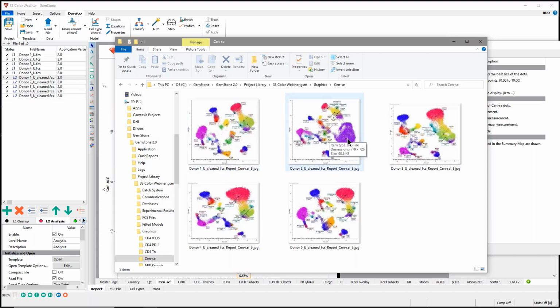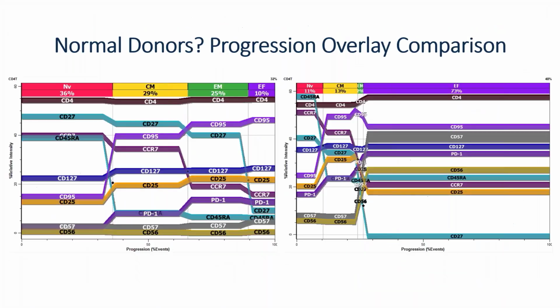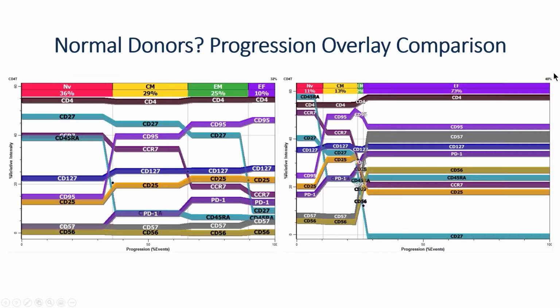And we can see this data file here that has a very different looking population. We also have PDFs that are saved out. We have all the graphics, a report. I'm going to come back here to my PowerPoint. Okay, from this slide. Sorry, I get a little bit of a lag here.